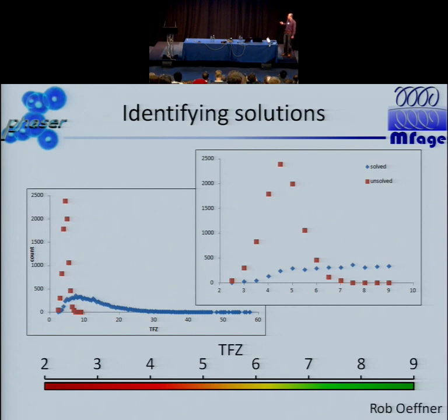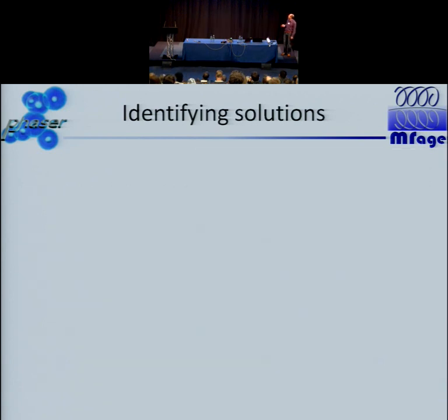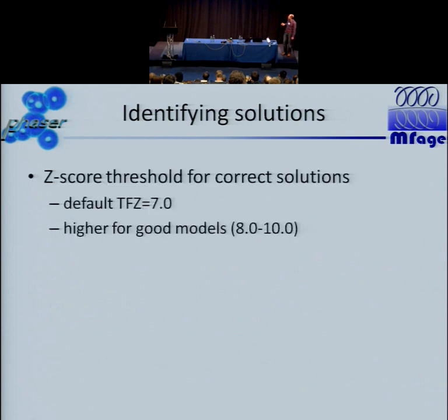So now what can we do with this? First, we can calculate the probability we have from a Z-score, and also the probability we want: what Z-score do we need for this? If we want like a 99% probability, then we possibly want 7.5, and then we can accept this as a surely correct solution.